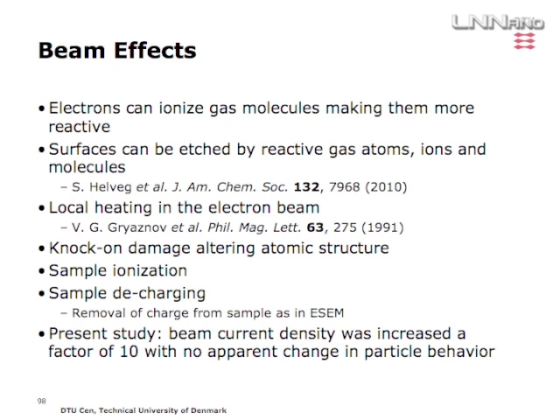But you could also have a benefit of having gas in there. You could have some decharging. This is actually what you use for your advantage in an SEM. If you have a very charging sample, then you would put a bit of gas in there and you can get rid of the charge.